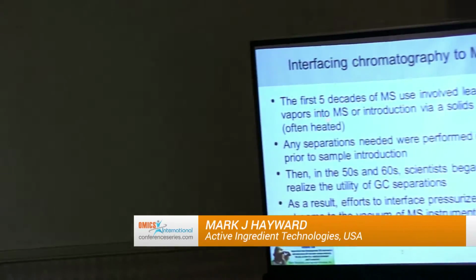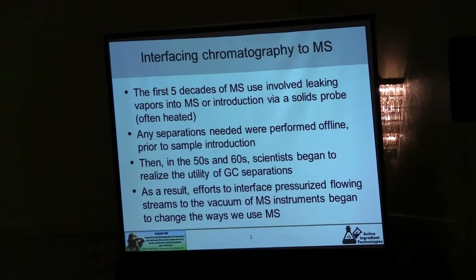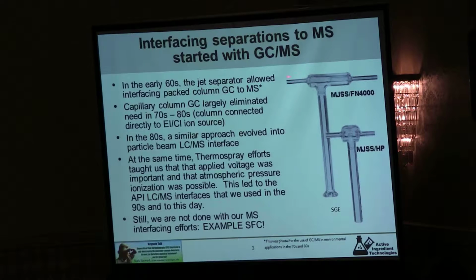So people have been trying, sometimes successfully and sometimes not, to interface chromatography to mass spectrometers. This worked pretty well in the gas chromatography days, and used devices like this, the jet separator, so you're essentially pushing everything through a small orifice, and then there's a small break in that path where a vacuum is applied to it. And believe it or not, these are ones from the 50s and 60s, but the interfaces of mass spectrometers still use similar approaches toward getting the sample in.